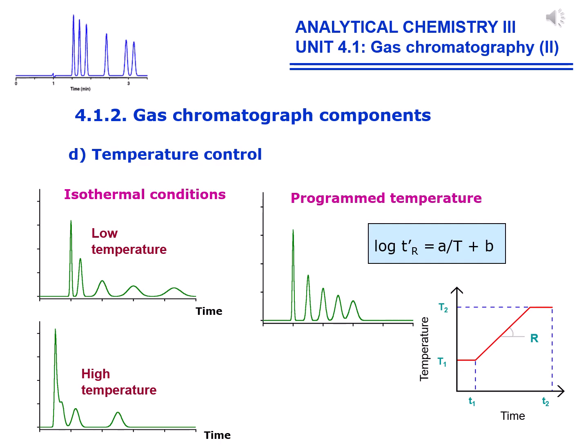On the other hand, if we work under isothermal conditions at higher temperature, the first compounds leaving the column close together and don't separate properly. Look at the bottom left figure. In either case, a good separation has not been obtained. The solution would be to carry out a better separation by applying a linear rising temperature program, allowing the separation of the mixture of compounds in the shortest time with good resolution.